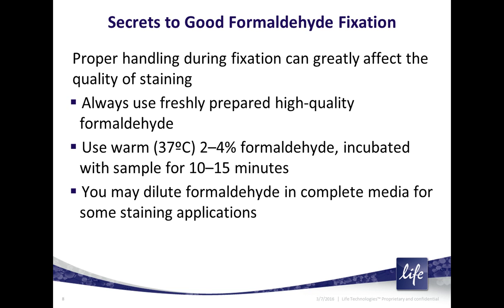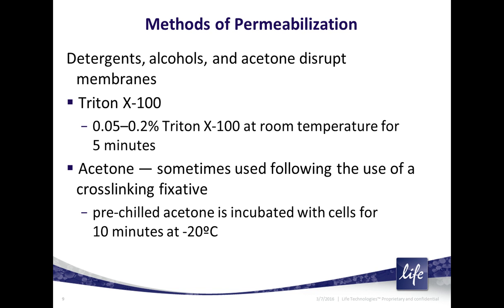Some cells are so sensitive that in the few minutes before they fix, just putting them in a cold solution or in PBS instead of media can cause cell morphology problems and even toxicity in that short time. So generally I recommend making it up in media. Okay, going on.